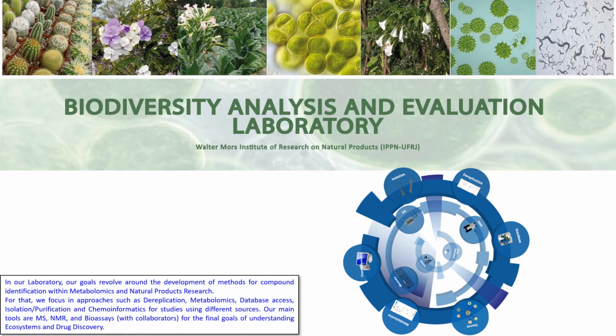So in our laboratory, our goals revolve around the development of methods for compound identification within metabolomics and natural product research. For that, we focus on approaches such as dereplication, metabolomics, database access, isolation and purification, and cheminformatics for studies using different sources. Our main tools are mass spec, NMR, and bioassays, this last one with collaborators, for the final goal of understanding ecosystems and drug discovery.